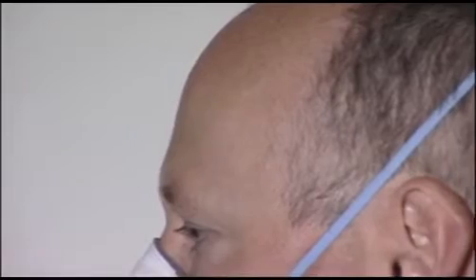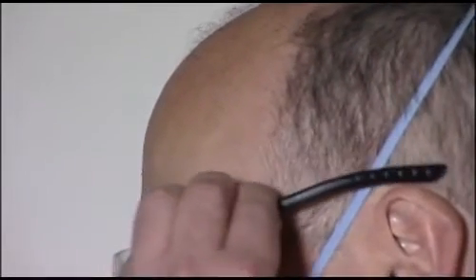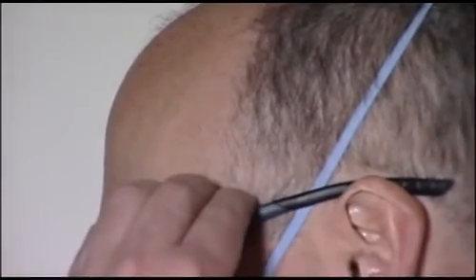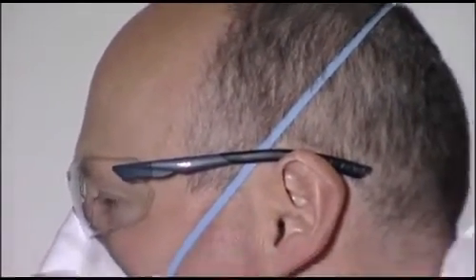Care must always be taken to ensure other safety equipment is compatible with your respirator and does not interfere with its fit. For example, straps should always be fitted underneath spectacle sidearms and hoods.